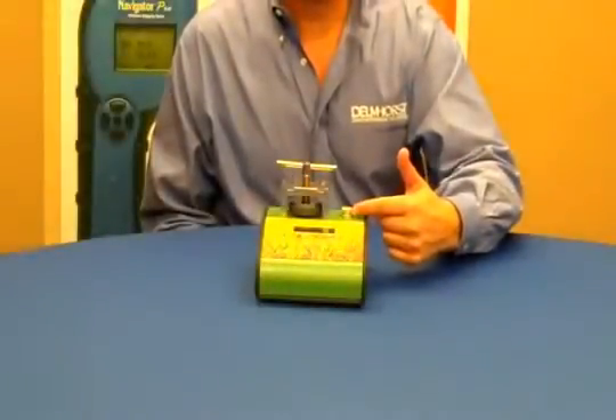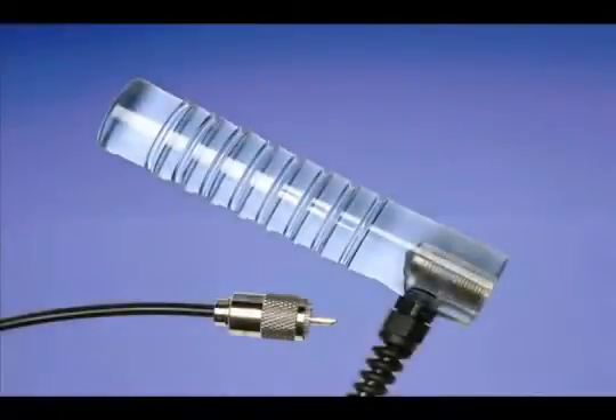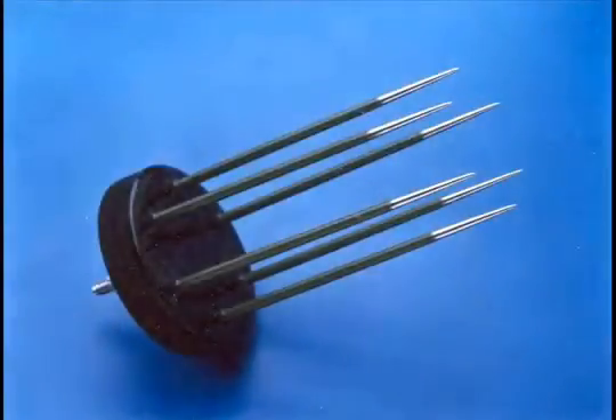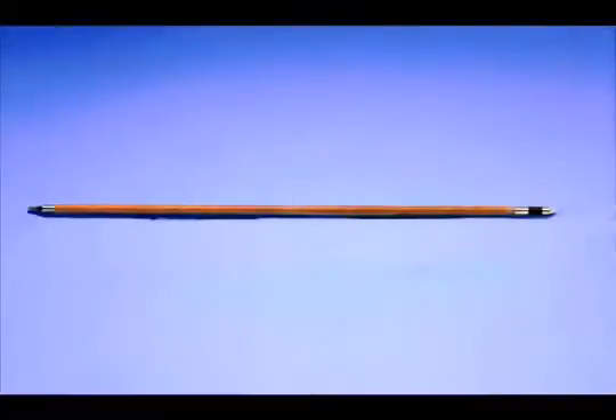The connector on the side of the meter will accept any Delmhorst electrode and is typically used with an H4 handle in conjunction with either an 832 flat disc with 6 long pins used for checking grain in bulk, or with the 830 series hay probes used for checking baled hay.